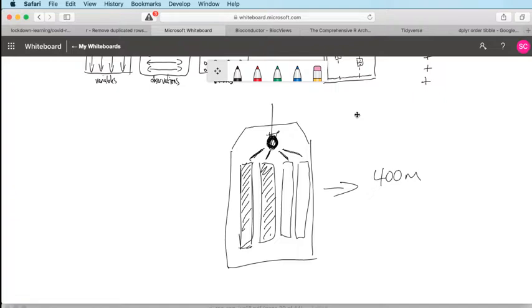Those reads are divided up between the libraries that you load in this loading point. So you pool your libraries, you put them onto your flow cell, you generate your reads, and those reads are split between your libraries, and you can assign them out to the different libraries by the barcodes that are attached to them.